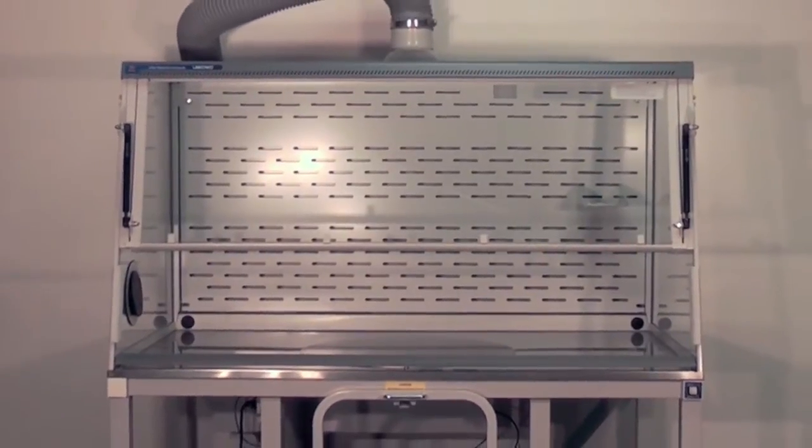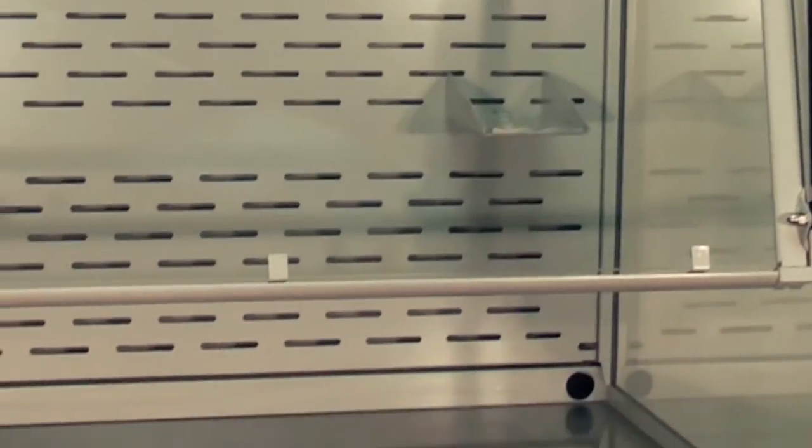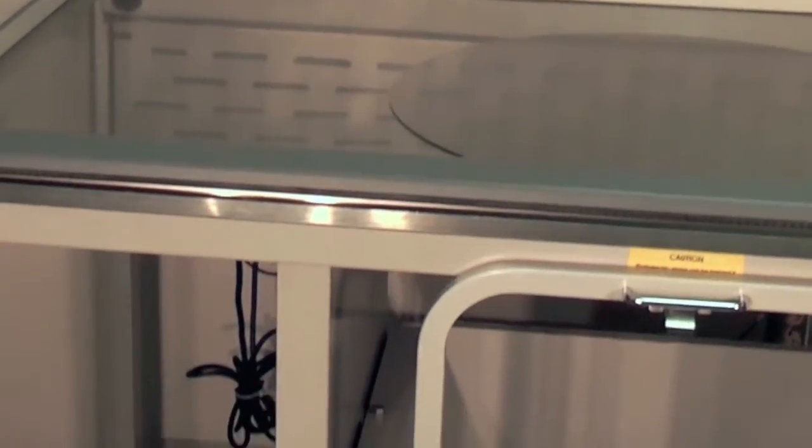Expert bulk powder enclosures are designed to provide user protection from toxic airborne particulates generated during bulk powder transfer and weighing operations.